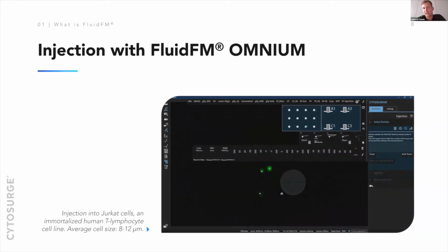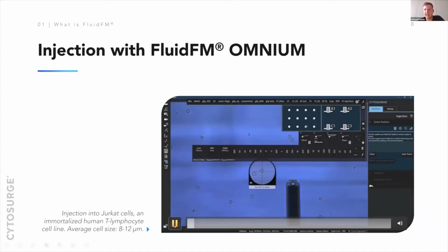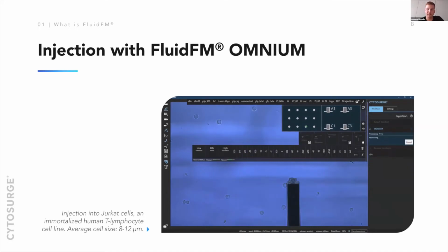Now, one of the big advantages of this method is that it's automated. So the only thing that we have to do really is to select these cells and then aim for the nucleus, the cytoplasm, wherever we really want. And then it just runs on itself. So it's quite comfortable to work with, in my experience. And so this is basically how the injection looks like.